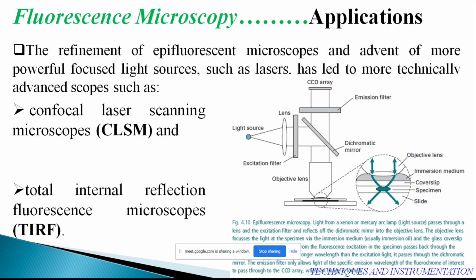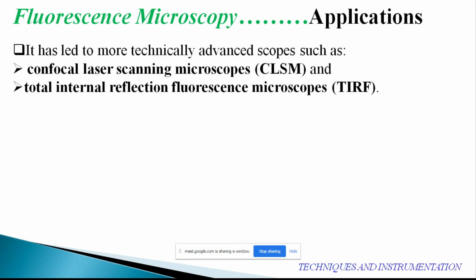It is possible, and due to epifluorescence microscopy, in fact, this is becoming a little bit more significant. Now, these microscopes, especially fluorescence microscopes, are often used for imaging the structural components of small specimens, such as a microscopic object in its live state itself.